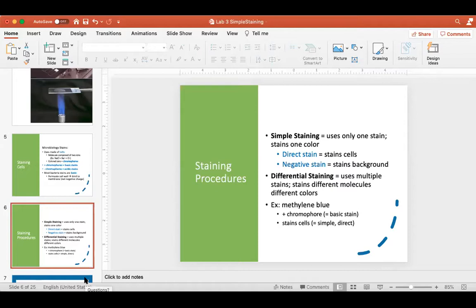A good example of a simple stain is the one we're using today — methylene blue. Methylene blue is very commonly used in the micro lab. Like most microbial stains, it has a positive chromophore so it's a basic stain, and it's also a direct stain so it stains the cells. And like the name suggests, it has a lovely blue color to it.